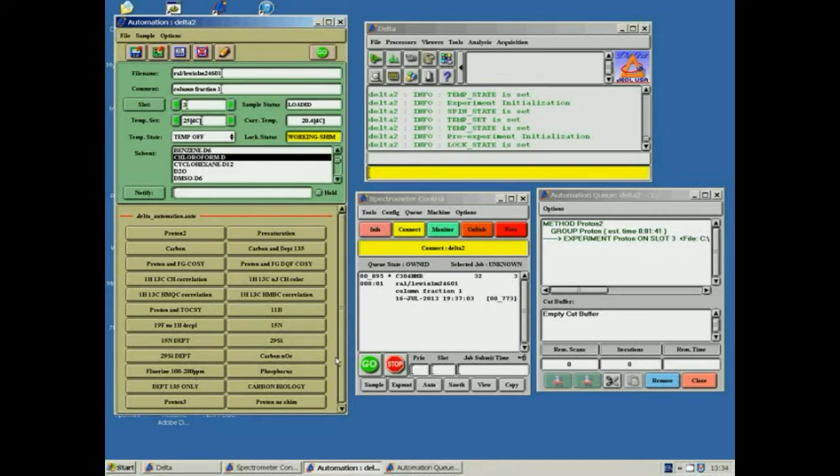If proton analysis is required, the settings have been pre-configured so you can simply click the button marked Proton2 and click Continue. If you require carbon analysis and have a pure dry sample, you can press carbon and Carbon-13 will be analysed. Other options include running Carbon DEPT-135, standard fluorine, and if the sample contains silicon with CHs directly attached, 29Si DEPT; otherwise a normal 29Si can be run. Also available are phosphorus and 11B. 2D NMR can also be run using Proton and FG COSY, as well as Proton and FG DQF-COSY, and proton-carbon correlation can be run.